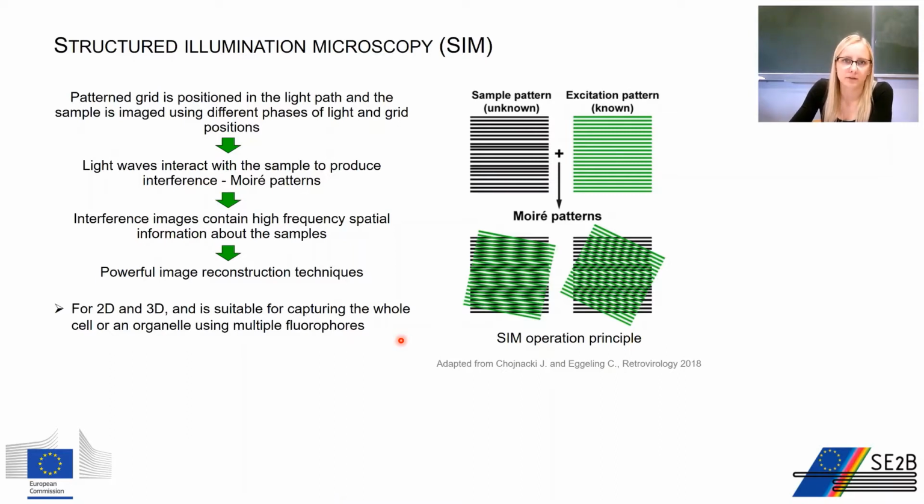And another quite different technique from those mentioned before is structured illumination microscopy, SIM. In SIM, the sample is illuminated through a periodically structured pattern, typically a grid-like high-frequency striped pattern. Then structured light interferes with the structures of the sample, and so-called moire patterns are created. Different images are formed by scanning and rotating these illumination grids, and the obtained interference patterns contain super resolution information about the sample we are studying. And the super resolution image is formed after non-trivial computational treatment of the obtained interference patterns.